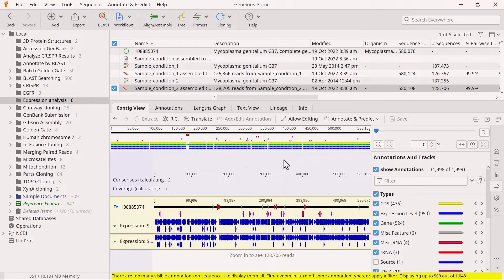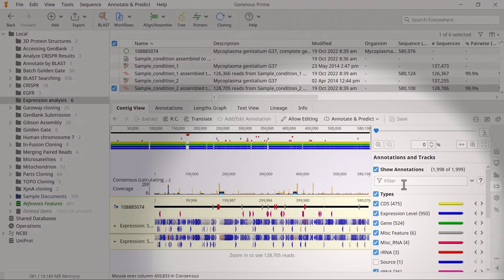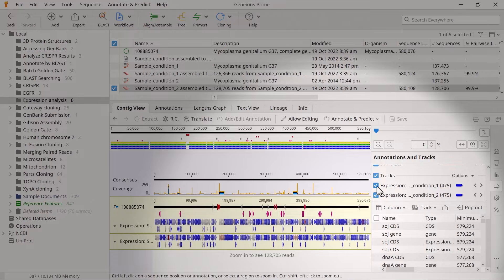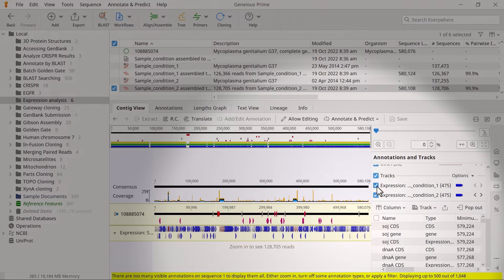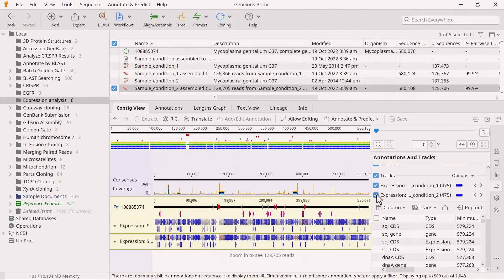However, if you have multiple reference sequences for each sample — such as one set of reads mapped to multiple chromosomes — then you should select all contigs from that sample and run them in a single step. Once you have saved these results, you should see different expression annotation tracks, one for each sample, loaded on the reference sequence and both assemblies.